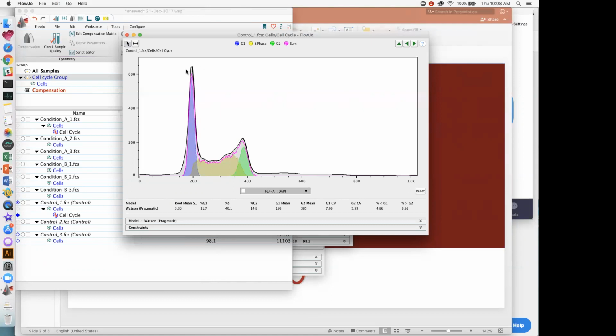There's also, in the case that you cannot identify the G1 phase, drugs like mimosine that inhibit DNA synthesis at the very beginning, and therefore will lock the cells at the very start, and you'll see a very nice peak for the G1 stage of the cell cycle. So I would encourage you, if you are using primary cells, go ahead and use L-mimosine and colchicine for your G1 and G2 controls. If you're using cell lines, normally you can get away with simply a random cycling population of cells like we have in this case.